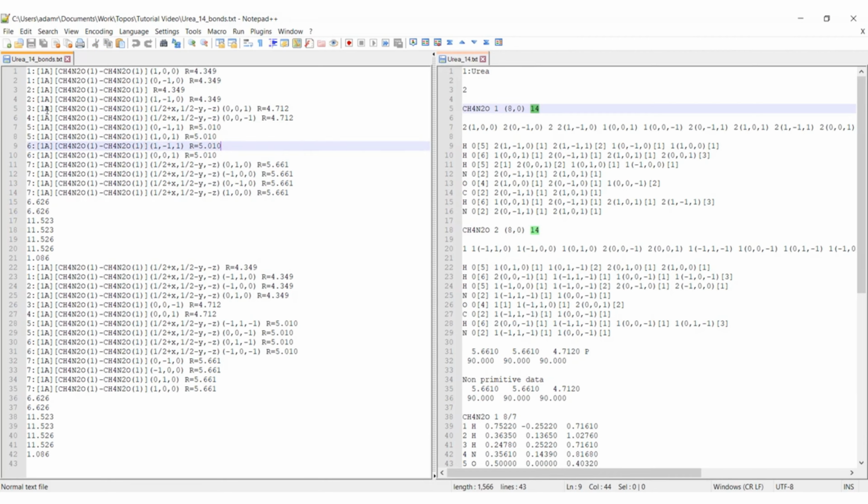So we've got 14 interactions, but 7 interaction types. And just looking at this line a bit further, you can see the origin species. So that's what type of species it is, and that's what the A stands for. It also corresponds to that dummy atom that we saw in the visualization stage. And this 1 here corresponds to a symmetry position or a type of that molecule. So if you saw 2A here, it would be the same composition chemically, but it would be a different coordination or symmetry position.